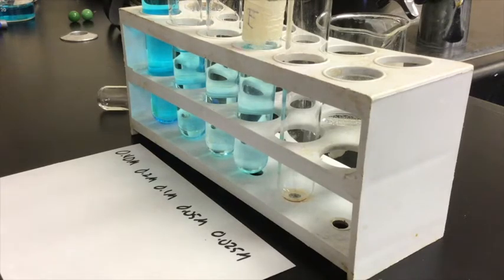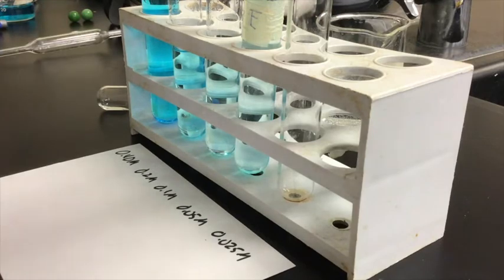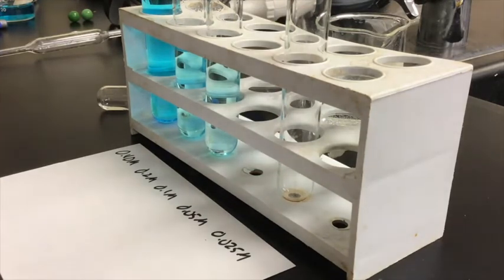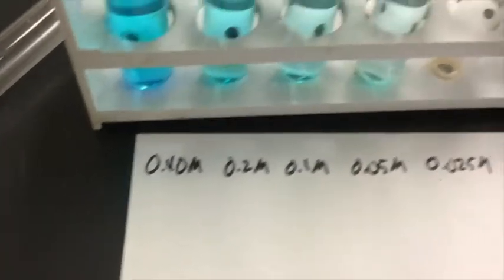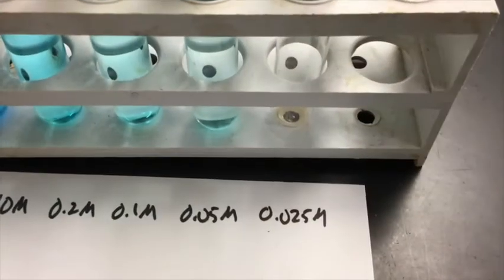And now, after I do that, it has been cut in half again. So it is now 0.05 molarity for my solution. And again, all I got to do is put the cap on and shake, shake, shake this guy up. That's 0.05. So again, by cutting each of these guys in half, I started at 0.4, then to 0.2, then to 0.1, then to 0.05. One more to go.